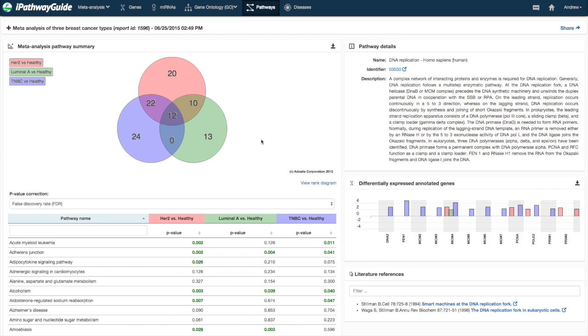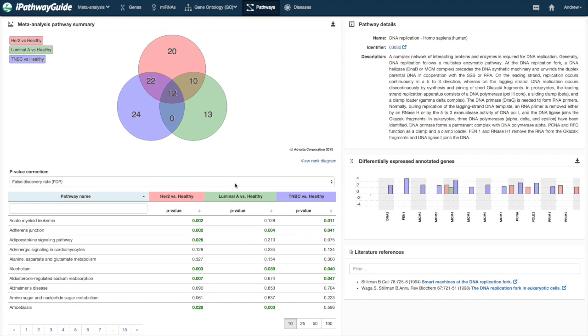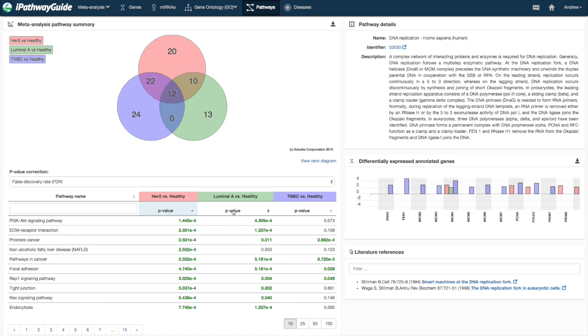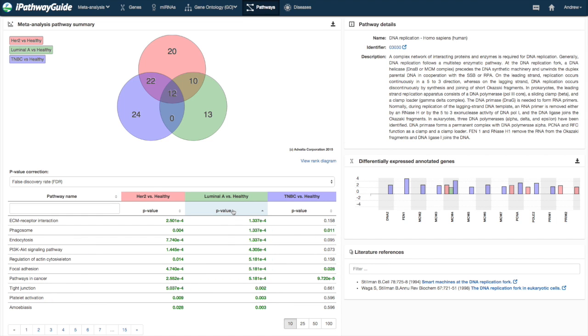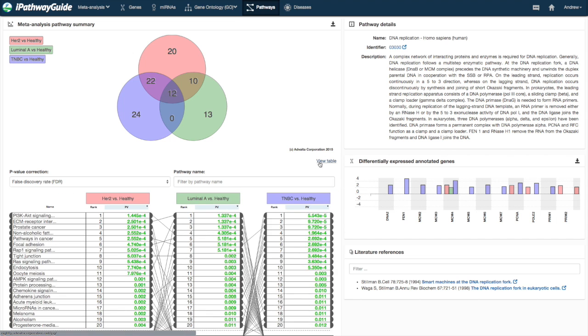Below the Venn diagram is a table that can be sorted and searched. The default view for the table is a simple list ordered by p-value or fold change. An alternative rank-based layout is also available which may help assess relative importance of entities between the contrasts.